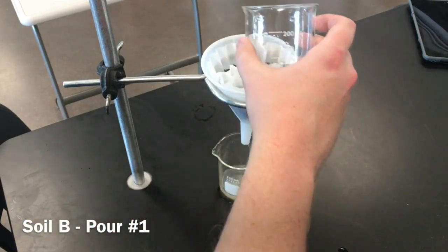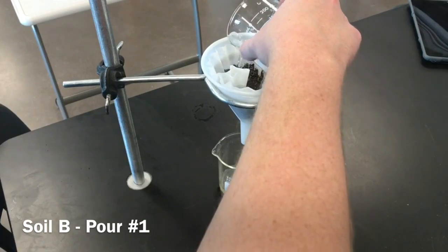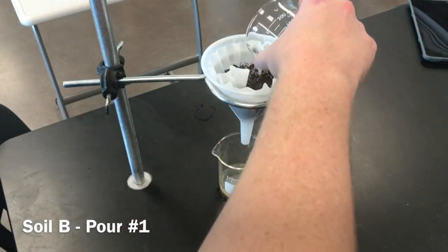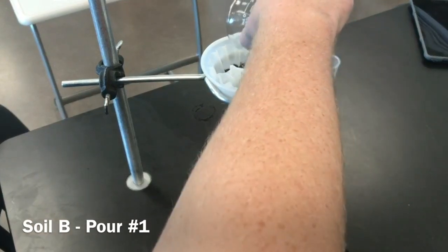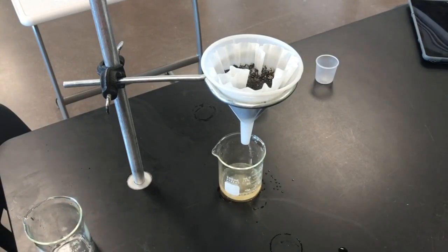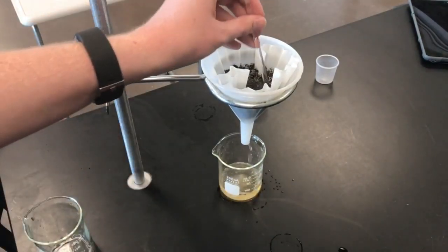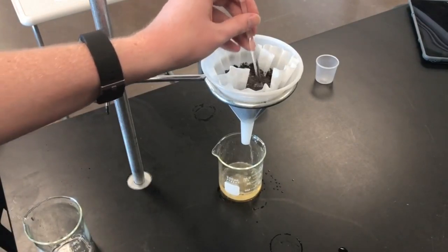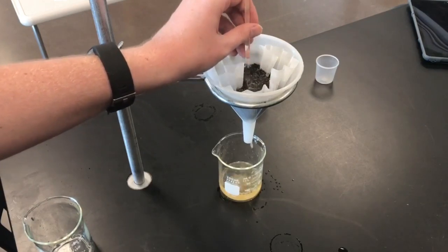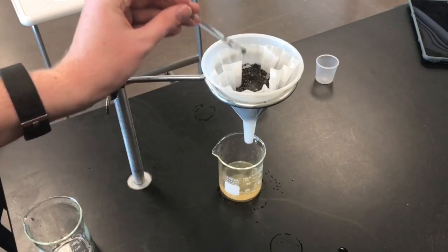Actually, the slower that you pour it, the faster this is going to go. So if you dump it all out at once, you're going to be waiting quite a long time for it to come out. Looks like mine's coming out just a little slow. So again, you can take a stir rod, as long as you don't break anything in the coffee filter, should be totally fine. Mix around my solution a little bit.